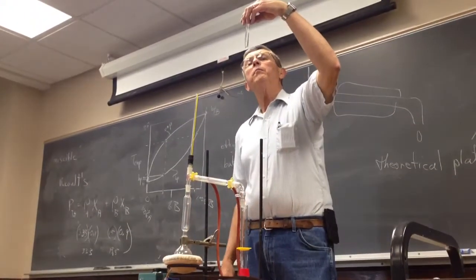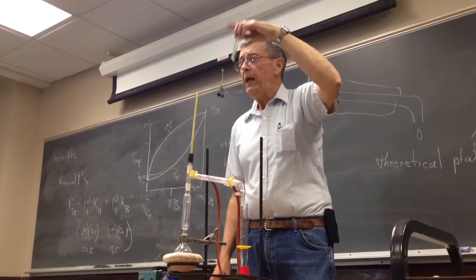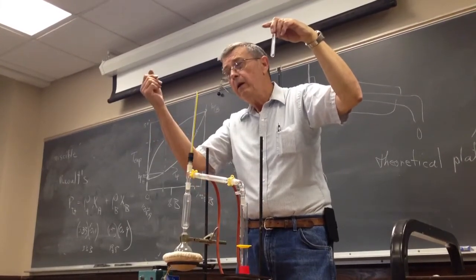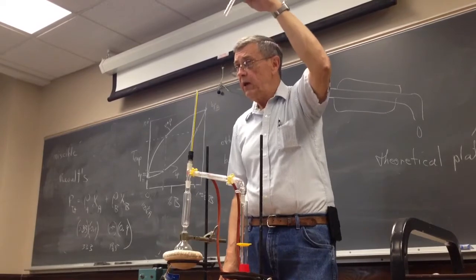Before I start, I want to get myself 5 test tubes. I want to label them SA through A, B, C, D, E. So I get my 5. 2 mils is going to go in here.